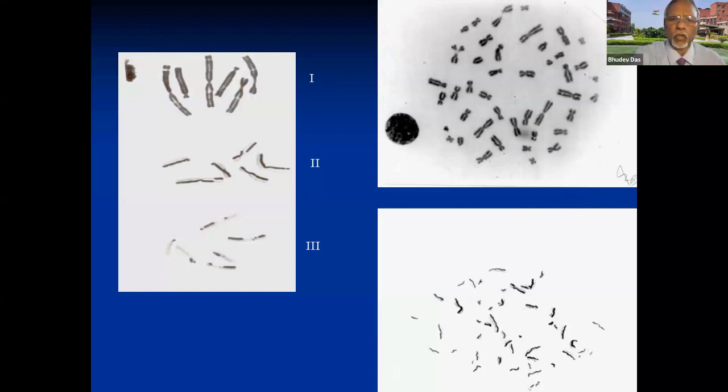On the other slide, on the left side, are barking deer chromosomes. That is only 6 chromosomes. See how long and how beautifully they are demonstrated. And these are the different cycles. Using BrdU, you can go for the second cycle and third cycle. With a clean preparation of simple metaphase plates, you can distinguish whether there is any deletion, breaks, and any abnormalities in general.